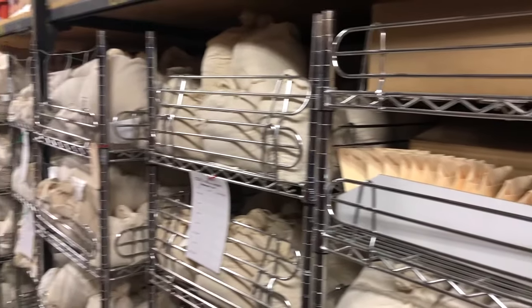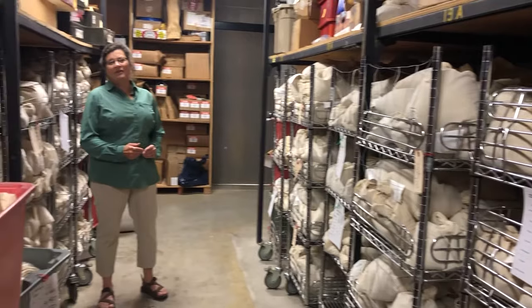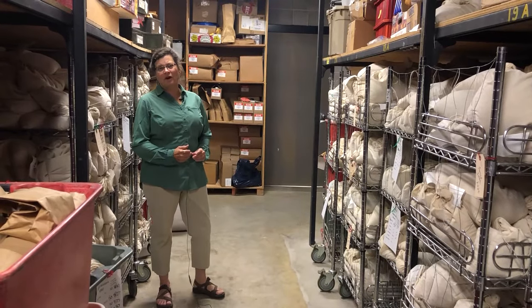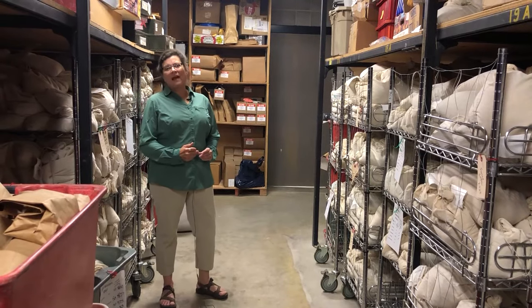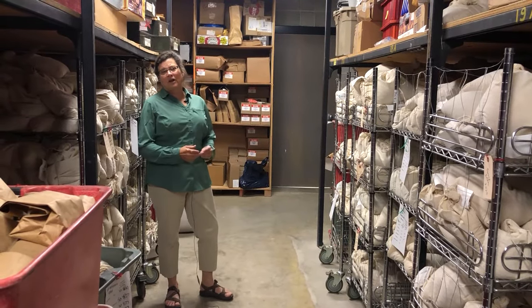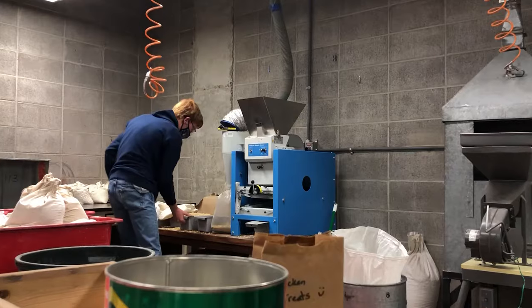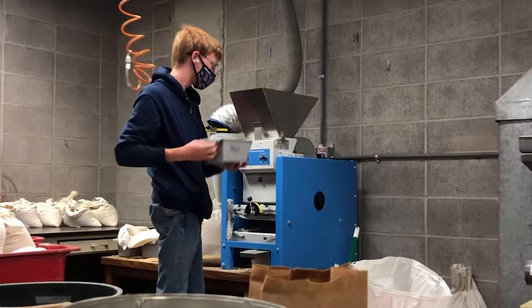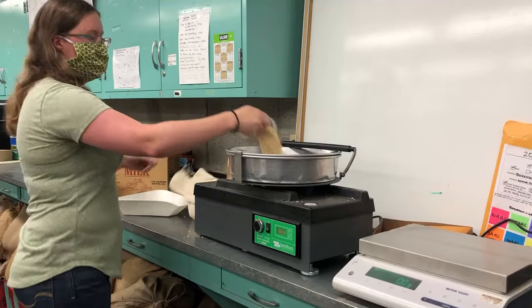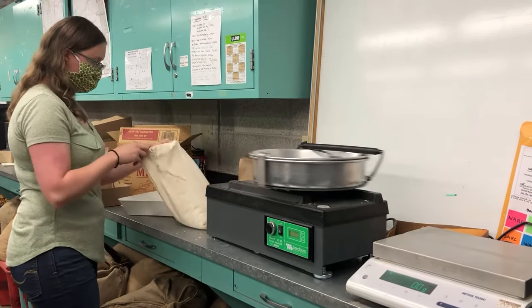Now we're in the seed room at MSU. The seed room shows us that even though the field season is over, we're not done with our work. What you see are bags of seed that were harvested just a couple weeks ago. Now they're going through the processing step where they have to be cleaned — we get yield, plump, and test weight — and then they go over to the malt lab.